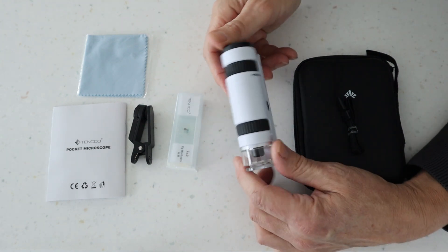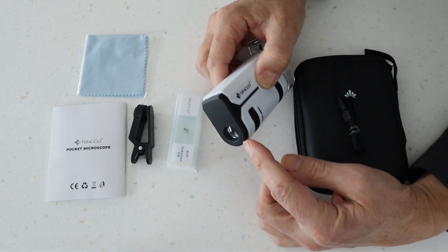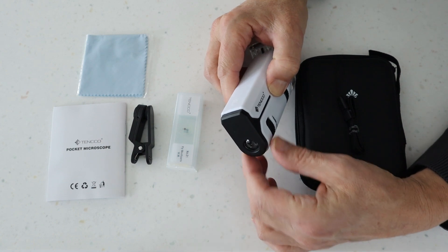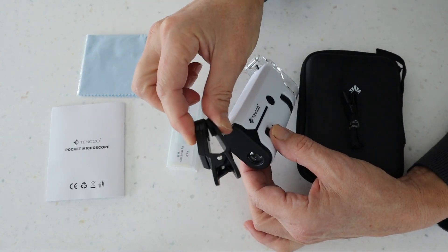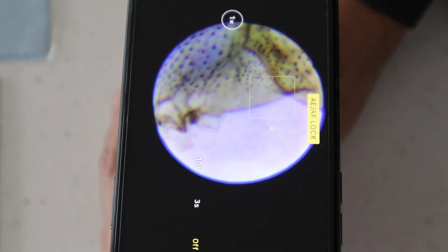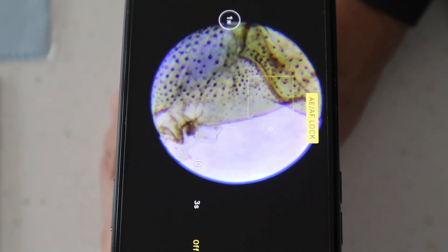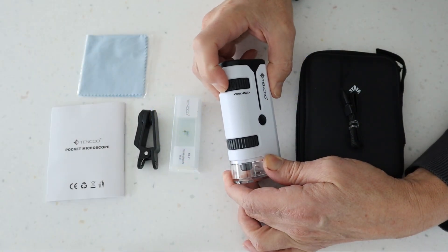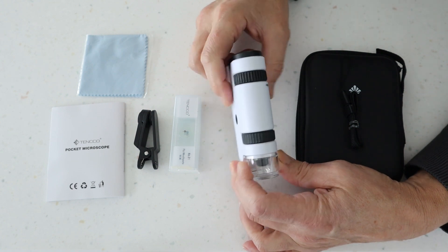In terms of the microscope itself, you have your viewing lens here — that's your eyepiece lens which you're going to be looking down into, or you're going to be using the clip to attach your mobile phone. On this side you have your magnification, which is 100 times to 250 times magnification — a really great range. And then this is simply your focus wheel at the bottom.